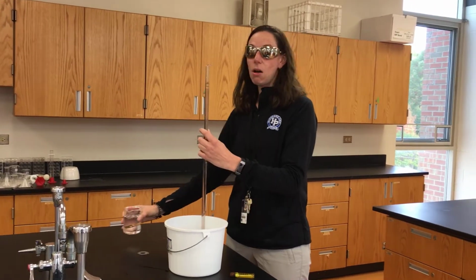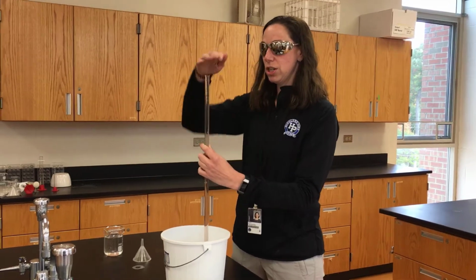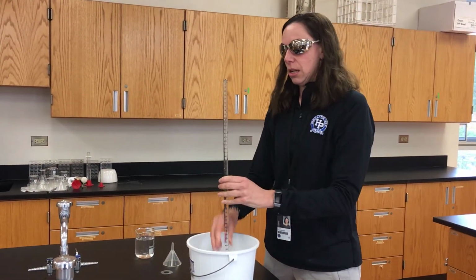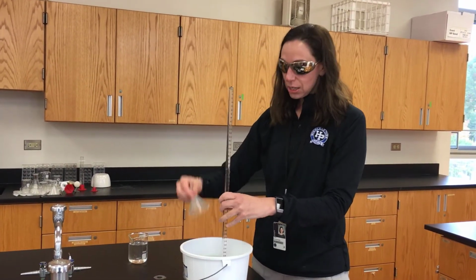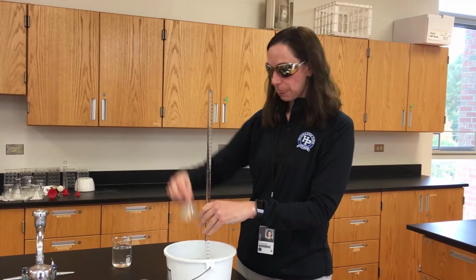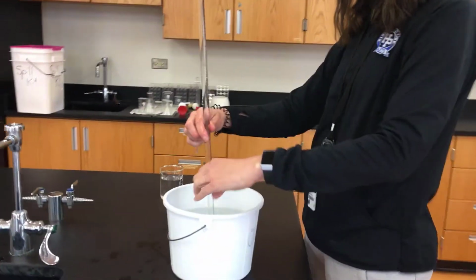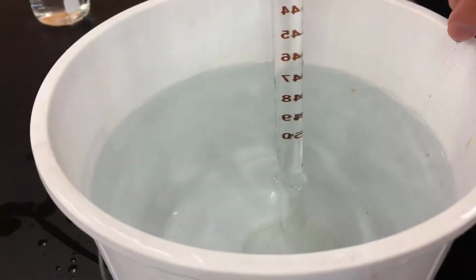So I have this filled all the way to the top with no space above. And what I'm going to do is cover it and flip it over so that we hopefully don't get any bubbles. And then I'm going to take a funnel so that when I push the button to release the butane, it all goes directly into the eudiometer. Okay, so I'm going to put that underneath there. Hopefully we have enough water to cover. Can you see it?